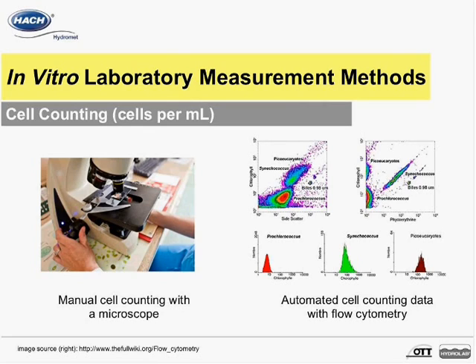In the flow cytometry counting method, a flow cytometer instrument is used to count phytoplankton cells that pass through its measurement cell to determine cells per volume concentration. The graph shown on the right shows example data from a flow cytometer instrument.